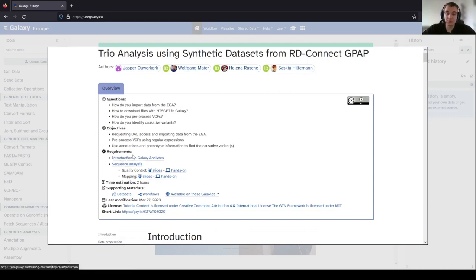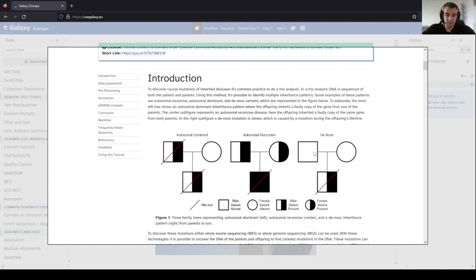It would be useful to first follow the introduction to Galaxy analysis and the sequence analysis tutorials before doing this tutorial. The tutorial starts with some introduction on variants and family trios. You can have different kinds of patterns such as autosomal dominant, autosomal recessive, and de novo. If you want to know more about this you can read the introduction; I won't go through this in this video.